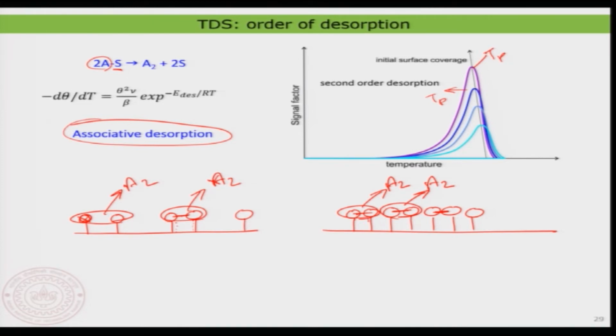That means the interaction between the surface and the adsorbate atoms is weaker than in the other situation, which would mean that you would not require the same amount of adsorption energy as you require at the lower coverage. And as a fact, you would find that the initial coverage strongly gives you a dependence on the peak temperature, and particularly if the initial coverage is very high, the temperature required for desorption is lower compared to that for a lower initial coverage.